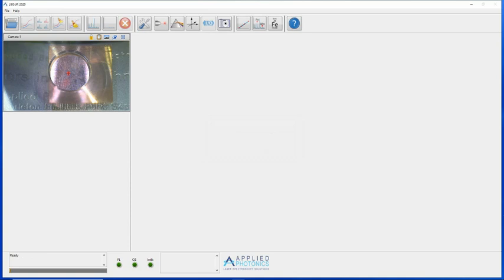If the acquisition parameters have been changed and the acquisition of a new analysis spectrum is initiated, a new background spectrum is acquired automatically and the existing file is overwritten automatically. As an example, we will configure an acquisition typical of those used to acquire the spectra included in the test report and shipped with each system. Note that reproducing the spectra included in the test report is an excellent way of checking the performance of the system.